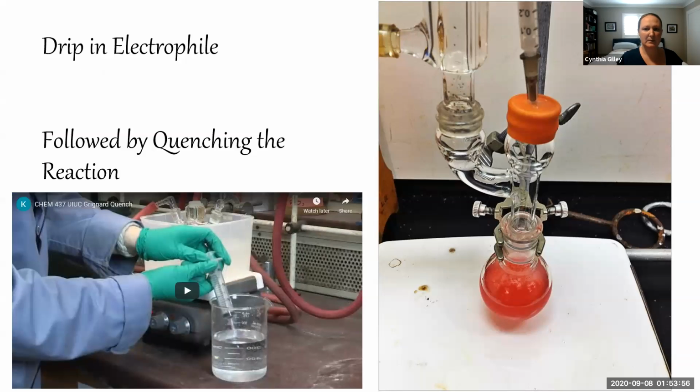So the next thing we would do is prepare a solution of the electrophile. In this experiment, it is benzaldehyde. But as we mentioned, there's a lot of different electrophiles that could be used. It doesn't have to be an aldehyde. It could be a ketone, an ester, it could be carbon dioxide, a nitrile, an acid chloride, or a lot of other different electrophiles.